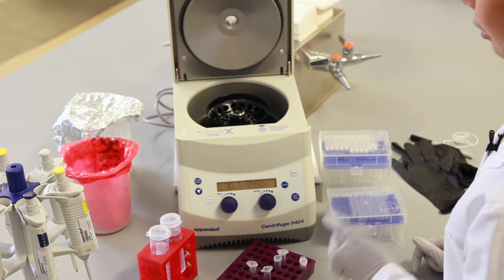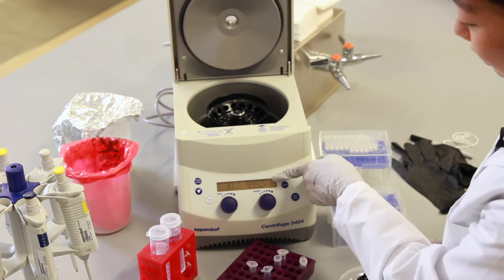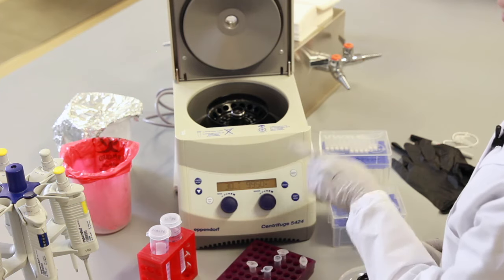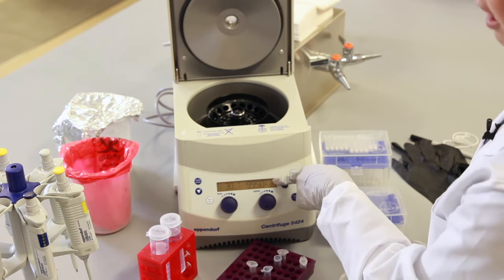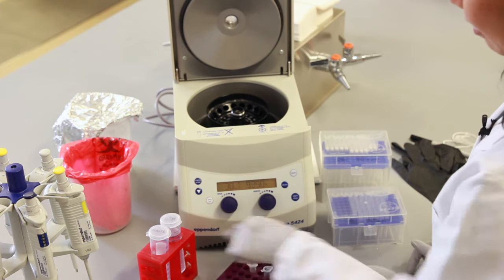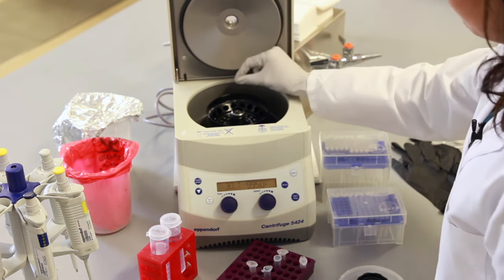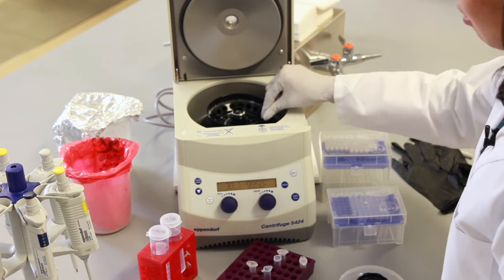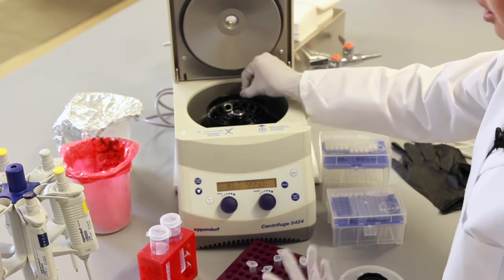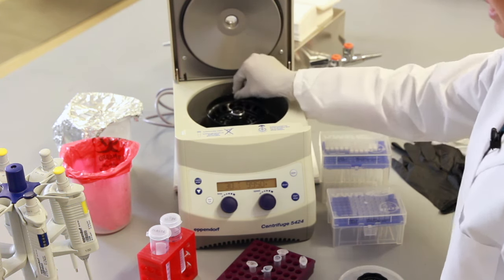The other setting to control is the speed. The important thing to take note of is the unit that you can see right here, which is in RPM right now. There are two different speed units, and the two units are very different from each other, so this can drastically affect your experiment if you're using the wrong one. You have RPM and RCF. RPM is measured in terms of revolutions per minute. So if you imagine I start here on the circle, I go all the way around 360 degrees, that would be one revolution around my circle. So RPM is really just measuring how many revolutions around the circle my centrifuge is making every minute.